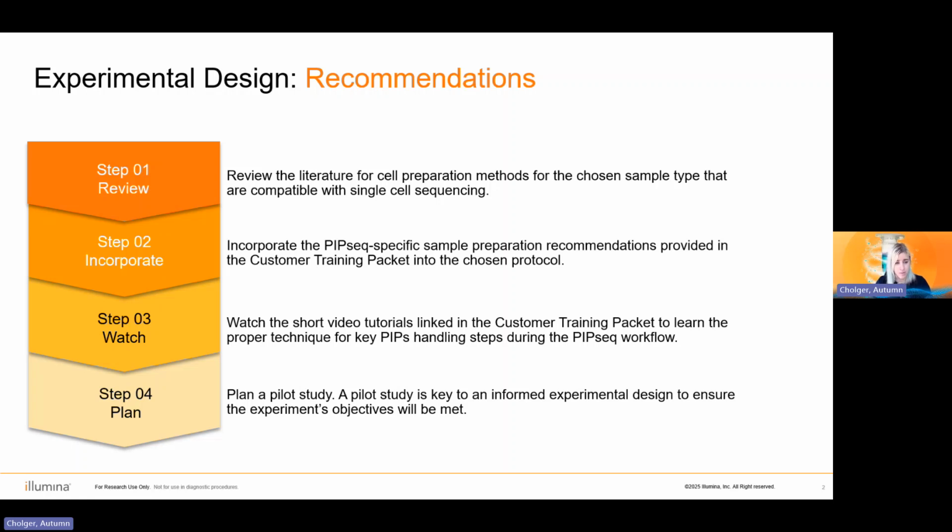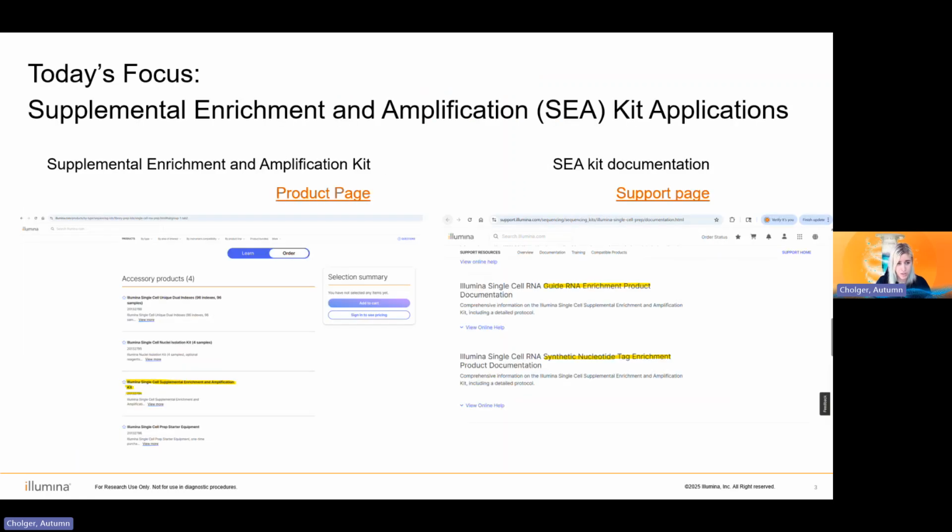And so everything that comes with the Supplemental Enrichment and Amplification Kit, we are discussing basically from the product page. It's this highlighted piece from the product page, but on the support page, it is these user guides that we have available on the Illumina Single Cell support page. Those links should be clickable, so if you are interested, feel free to click those hyperlinks. You can find that documentation that I'm referring to here.